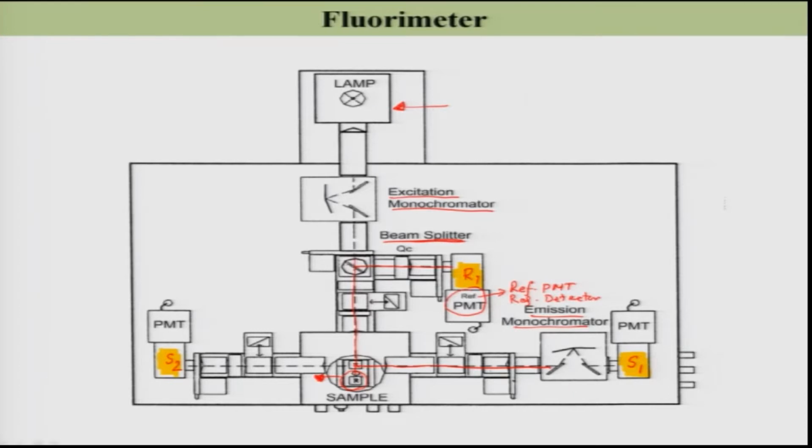It is also clear at this point that to get the corrected emission spectra you already have generated the correction file, right. The correction file is the S lambda file, I just explained. So, you already have this S lambda file for correction. Suppose now you are measuring emission spectra, you put your sample over here and you are recording your sample, right.